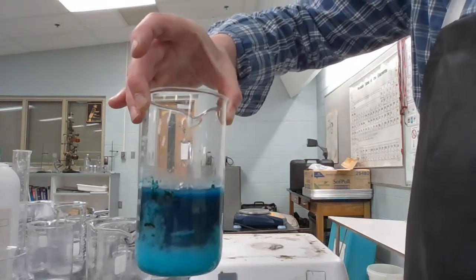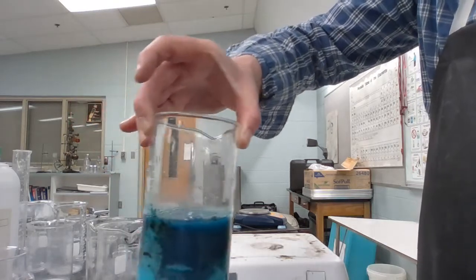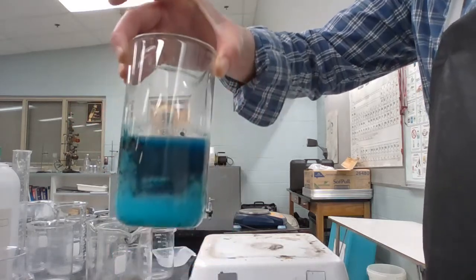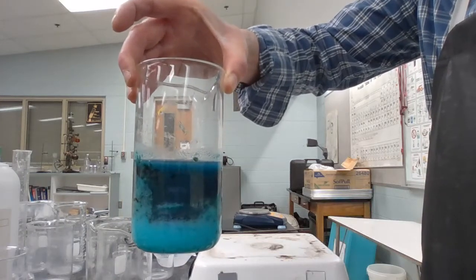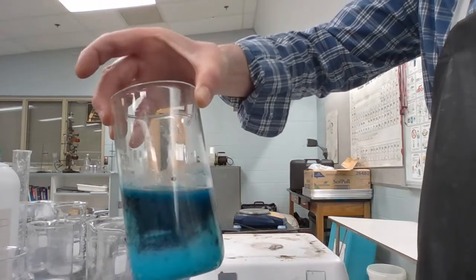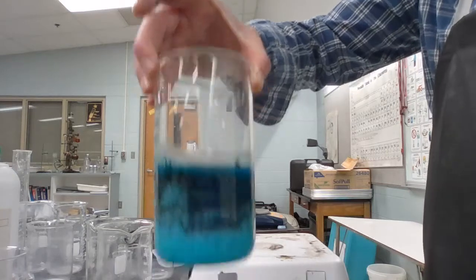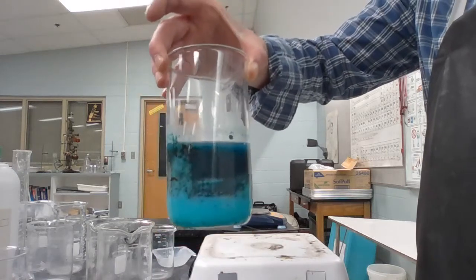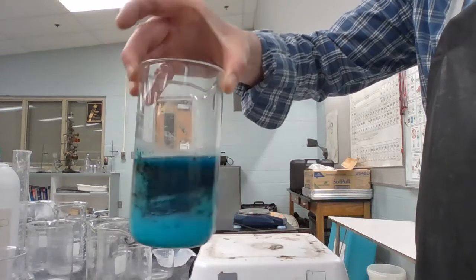Now that tells us that our copper hydroxide has become mostly copper oxide. So we lost the hydroxide. It broke down into just copper oxide and water. And so that's our black stuff there. So by heating it, we made it break down. And so it's a little decomposition there just from the heating.